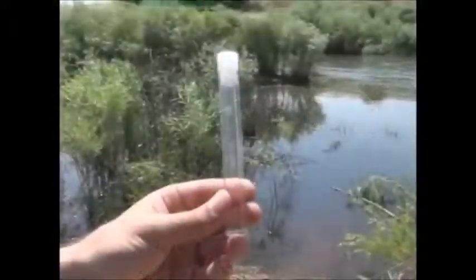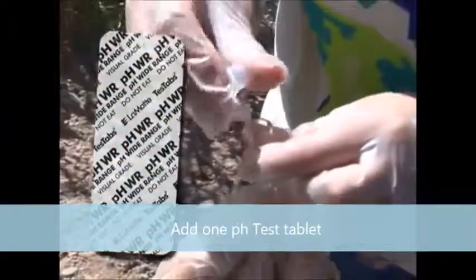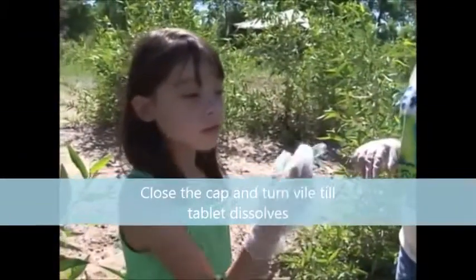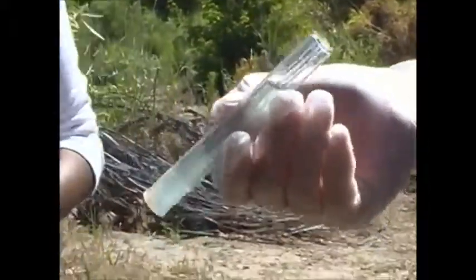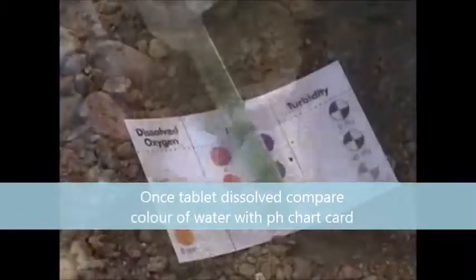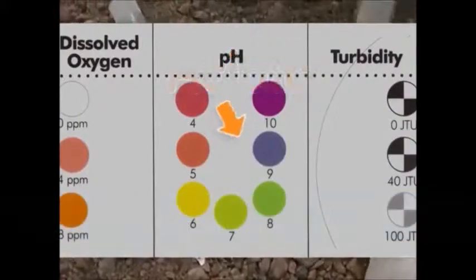For this test, use the longer vial and fill it to the 10 milliliter line. Add 1 pH test tab, place the plastic cap on top, and turn the vial end to end for a few minutes to dissolve the tablet. Once the tablet is mostly disintegrated, with only a few small undissolved bits, you can compare the sample to the pH color chart on the card. Note the value, which will range from 4, acidic, to 10, alkaline.